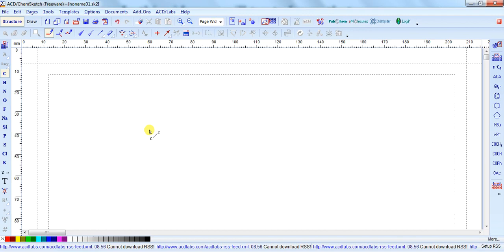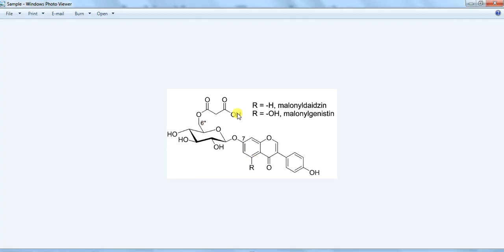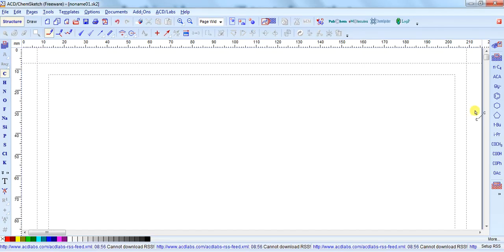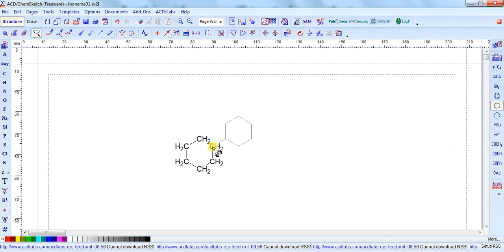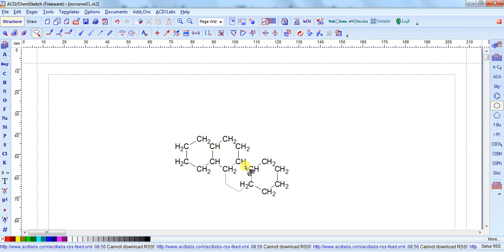Now let's start with how to draw our structure that we have taken as an example. First we draw the compound that is a ring structure. So we take this ring, click on it, and it will add a ring on the canvas. When you leave the structure and click, it will be automatically rendered.